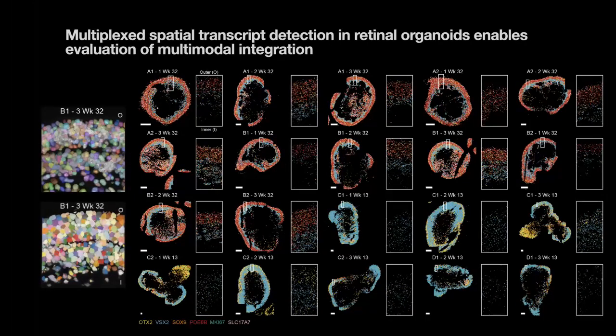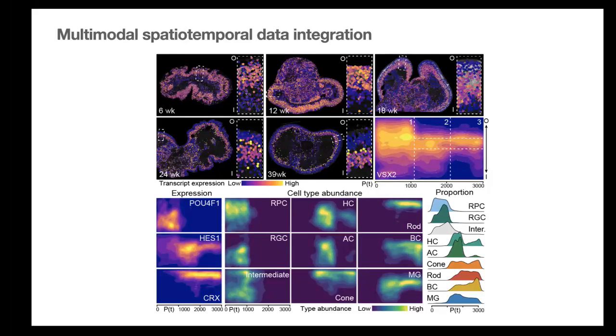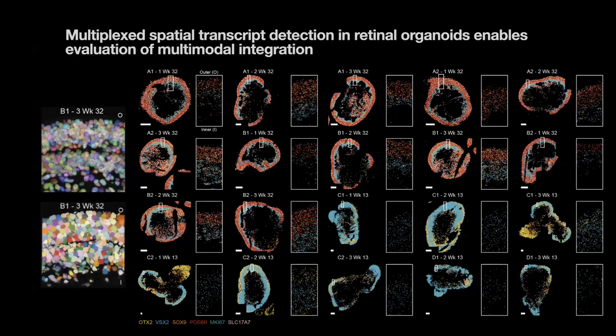And up till then, this was our first submission, and the reviewers said, yeah, but you make an assumption about RNA and protein, and it's not always the same. So for this, we sent some tissue slides to a company that does basically MERFISH as a service. We collected some more organoid slices on fresh frozen tissue and performed multiplex FISH. Then my quest was to bring yet another data set into the whole integrated thing.